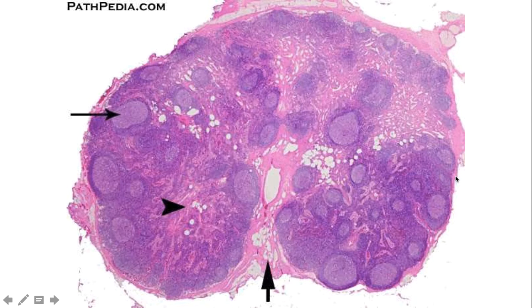As the lymph is moving from the outer area through the cortex, it's going to be moving through these areas referred to as lymph follicles. Here we can see a nice follicle with the germinal center. And again, the follicles tend to be on the outer surface, which we're calling the cortex. And as that fluid is weaving its way through these really narrow sinuses, it's going to be passing by these lymphocytes.